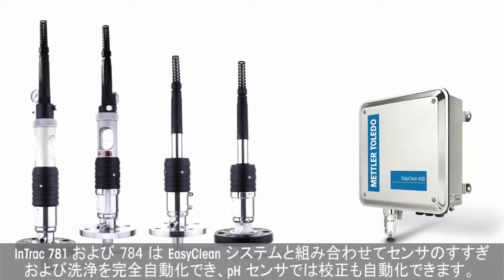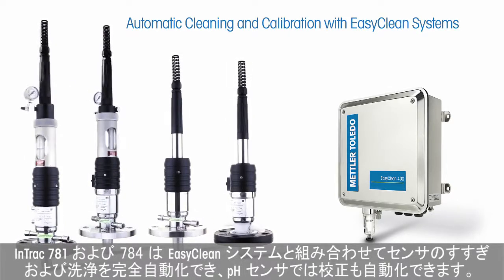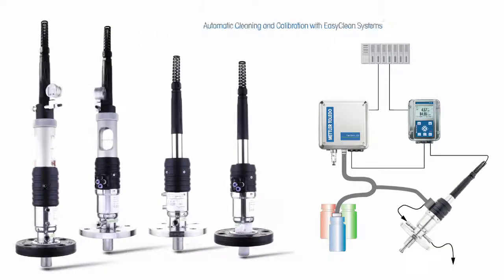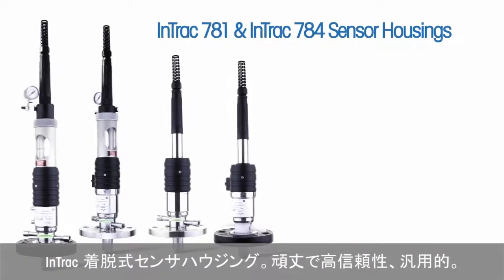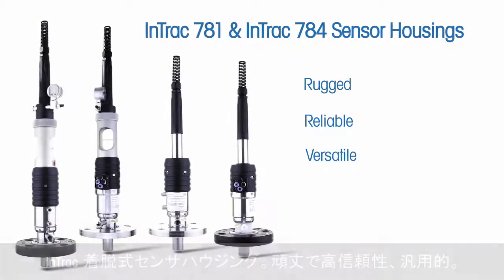InTrac 781 and 784 can be combined with EasyClean systems for fully automated sensor rinsing and cleaning, and also calibration for pH sensors. InTrac retractable sensor housings: Rugged. Reliable. Versatile.